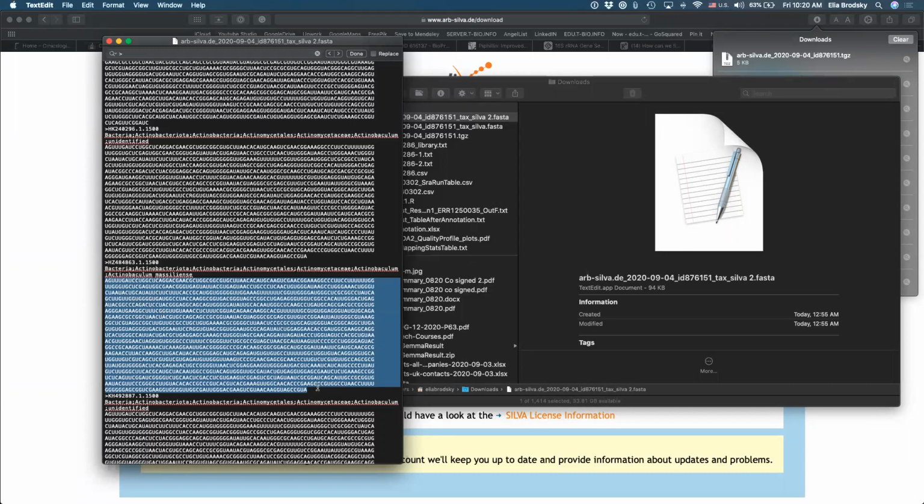So when you are exploring the way the data set is prepared, you want to search for a number of things related to the mapping. For example, you want to know the average read length. You want to understand how the data was prepared. Was it paired end or single end? And you typically want to also know which instrument was used to prepare the sequencing. That allows you to understand the level of error rates that you are expecting in your reads.